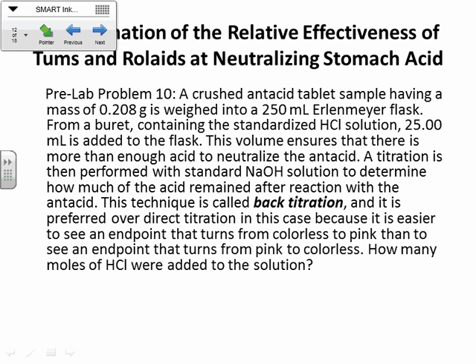Anyway, so you've got a titration, and a random student is going to do what's called a back titration here. Now, the reason this student is going to do a back titration is because it's really hard to tell the endpoint when you're watching something change from pink to clear. It's a lot easier when you're watching it change from clear to pink, all right? You can just see it better.